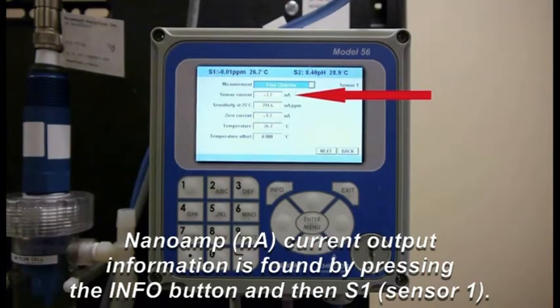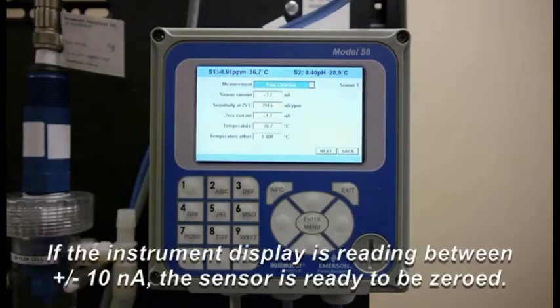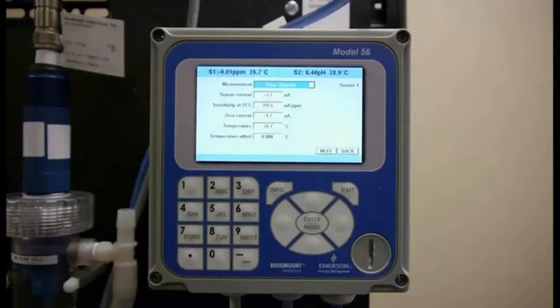It's right now reading at negative 3.7 nanoamps — that's the second line item on the display. The key is it has to be between negative 10 and 10 nanoamps, and it's been stable for quite a while, so I know it's ready to be zeroed.